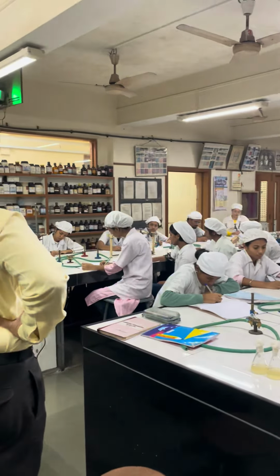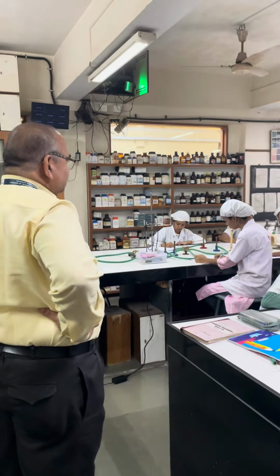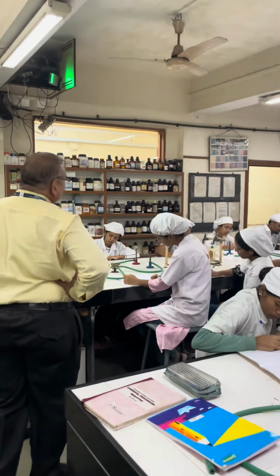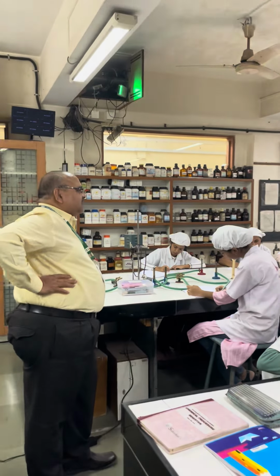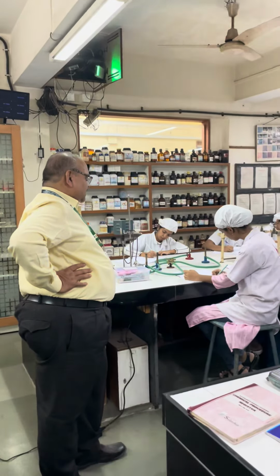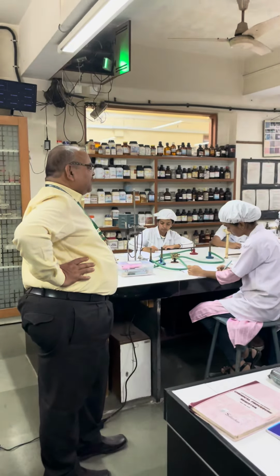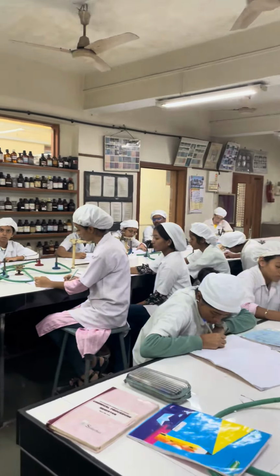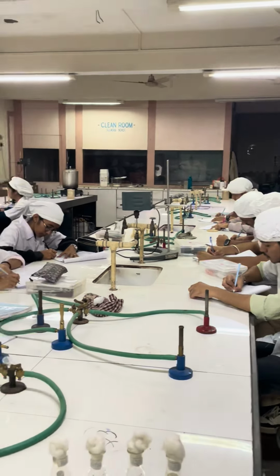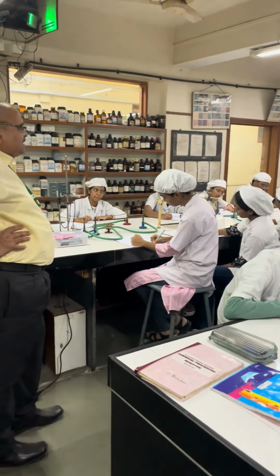Now, the quality of water, the potability of water, will be determined by using three different tests together. Those three tests are: number one, presumptive test; second one is confirmed test; and third one is completed test. Now here, out of these three tests, in your syllabus, the presumptive test is included. Confirmed test and completed test are not included in the syllabus. From this presumptive test, or MPN, you will get the idea about potability of water, or the idea about presence of coliforms in water.